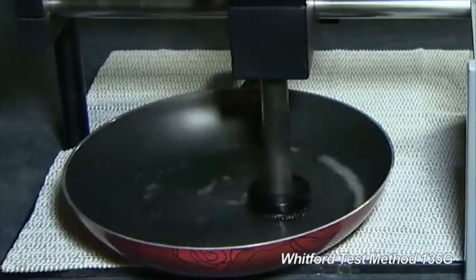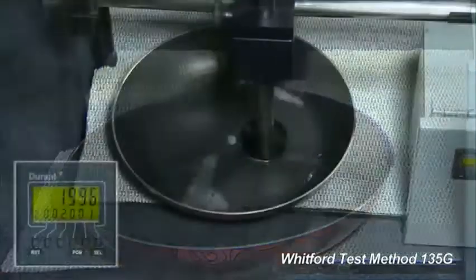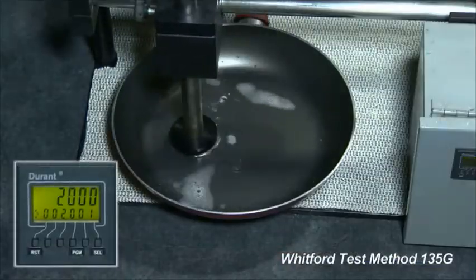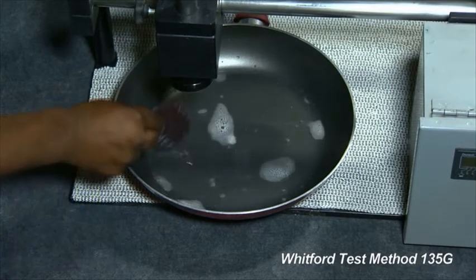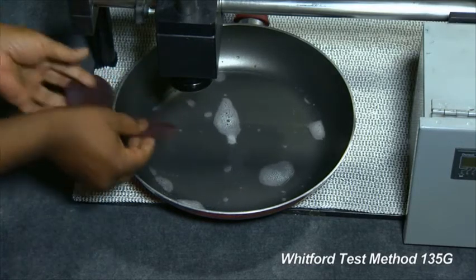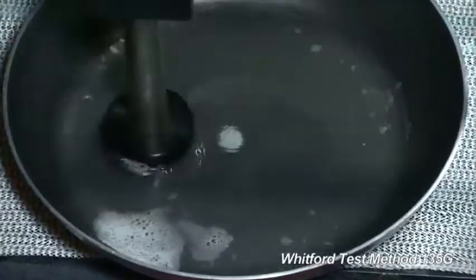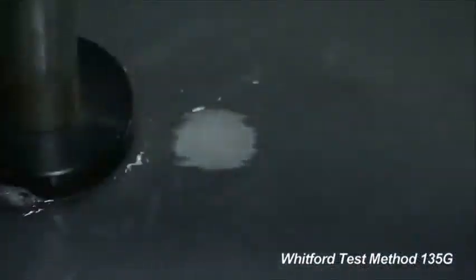Run the test for a specific number of strokes. Whitford stops it at every 2,000 strokes to change the Scotch-Brite pad. Continue running the test and monitor the strokes until 10% of the substrate shows through the wear area, at which point the test is over.